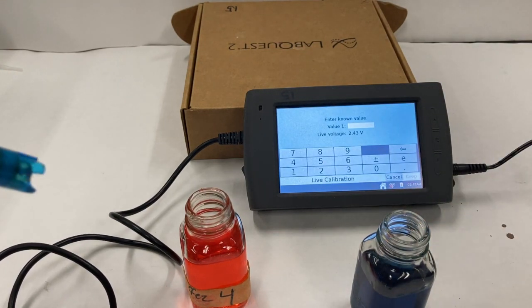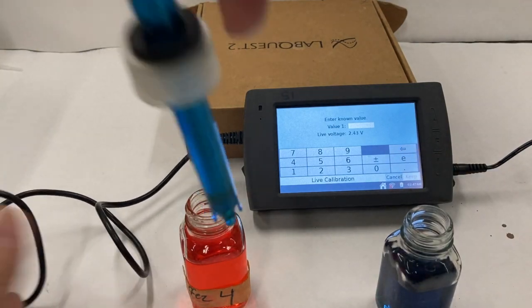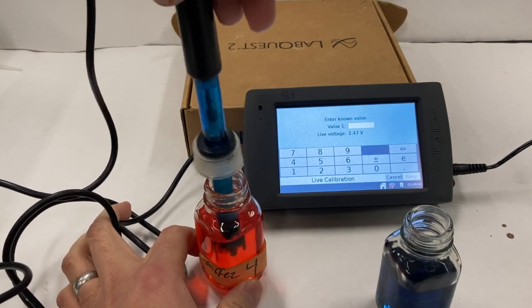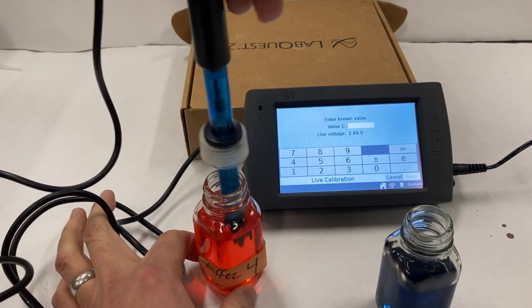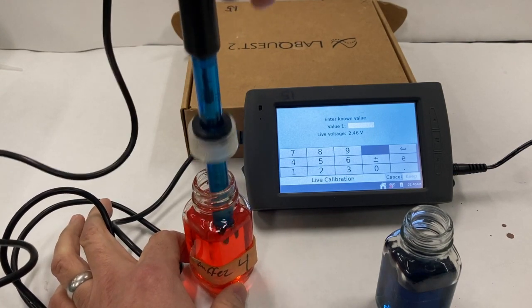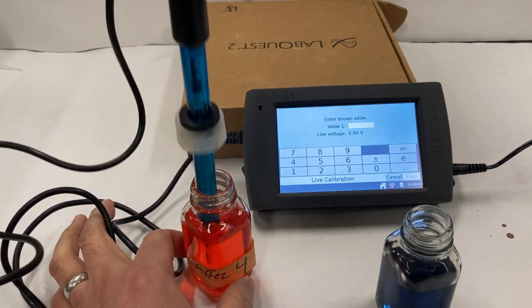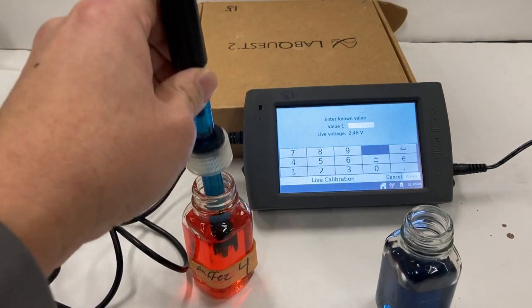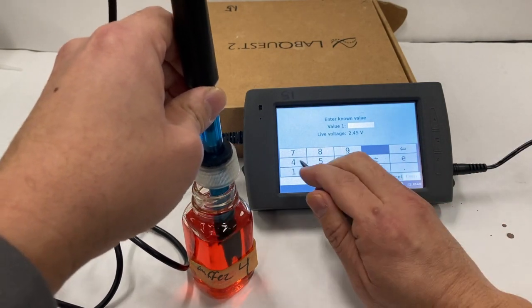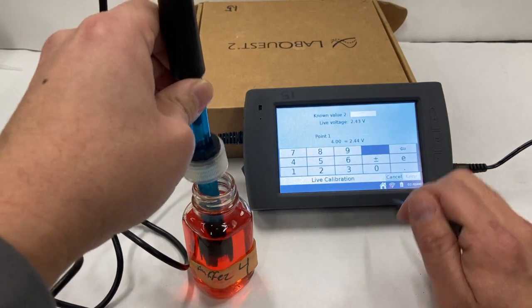And so I have two different solutions here. I've got these standardized buffered solutions, and I'm just going to swirl the probe in this first solution and wait for the live voltage to stabilize. And when it does, I'm going to enter in what the pH value of the solution is. Now, these buffered solutions are engineered to maintain a steady buffer or steady pH. So it looks like it's set there. And this is 4.0. And we're going to keep that value.